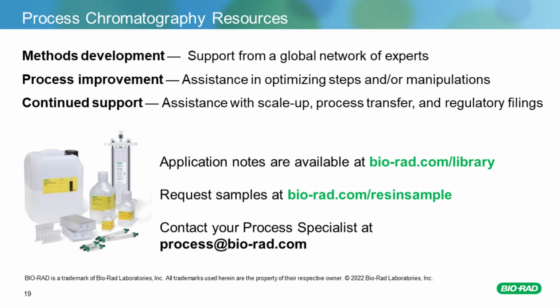It's a great question, Alex. You could definitely use it for larger oligos. Really, with the large pore sizes of the Nuvia HPQ, you could accommodate even larger oligos than 20 mers. Really, your limitation would be the ability of the HPQ to be able to bind the oligos, and then it would just be optimizing your process to get the correct separation.